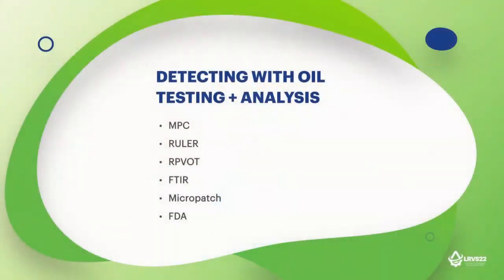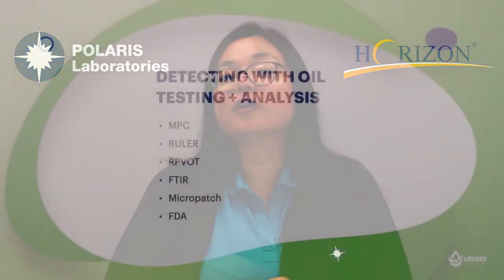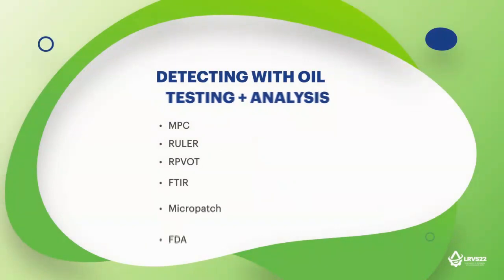Micropatch analysis, believe it or not, has also been a way for us to detect varnish formations in different systems where we normally wouldn't be able to pick up on that through our standard testing or traditional MPC or varnish analysis tests. And then lastly, we have also picked it up through our filter debris analysis. We have been able to flush out varnish formations that have been captured in the filter media, and we end up seeing that underneath the microscope.